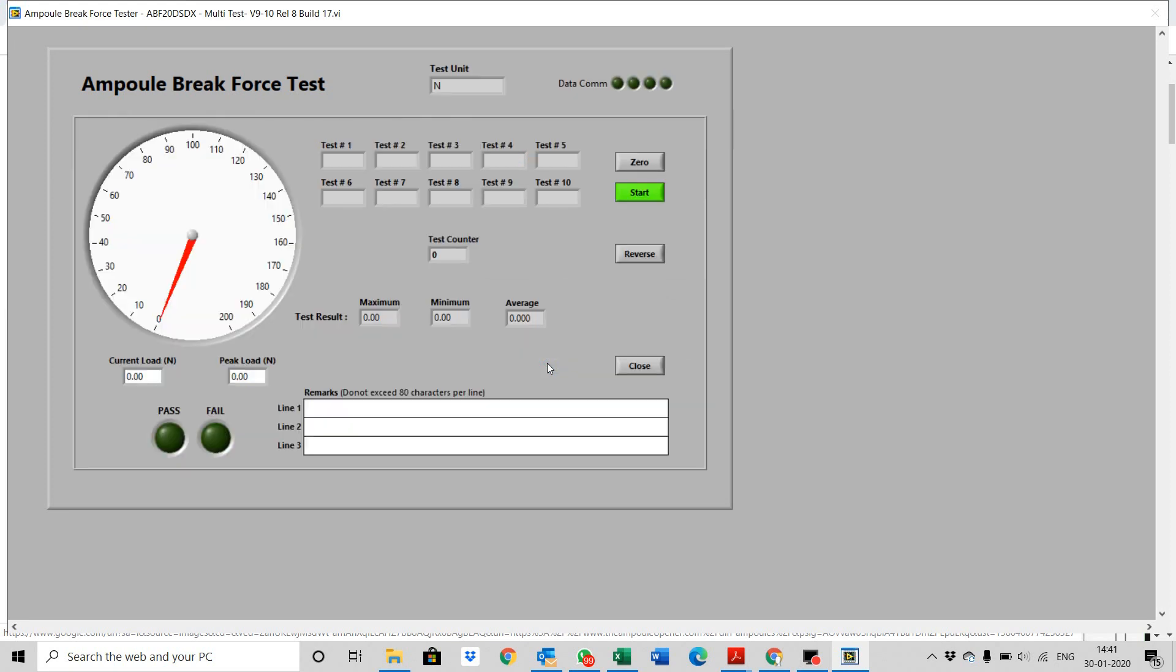This is your test screen. Press zero, then press start. If the gap between the wedge and the sample is more than 10mm, press jog button to allow the machine to move down fast.